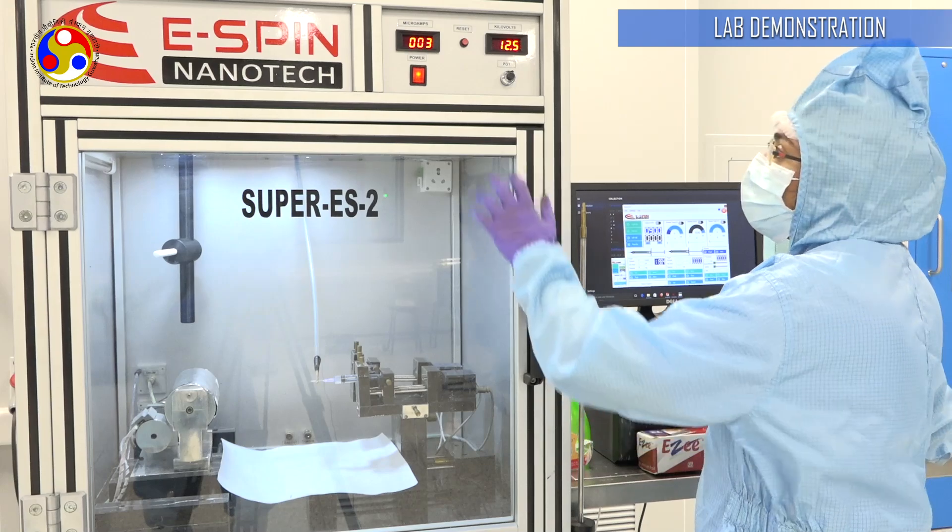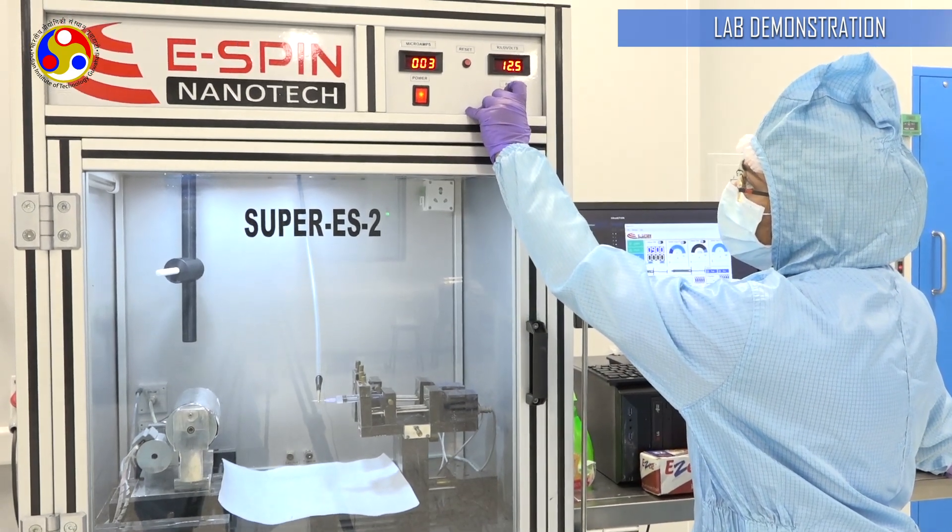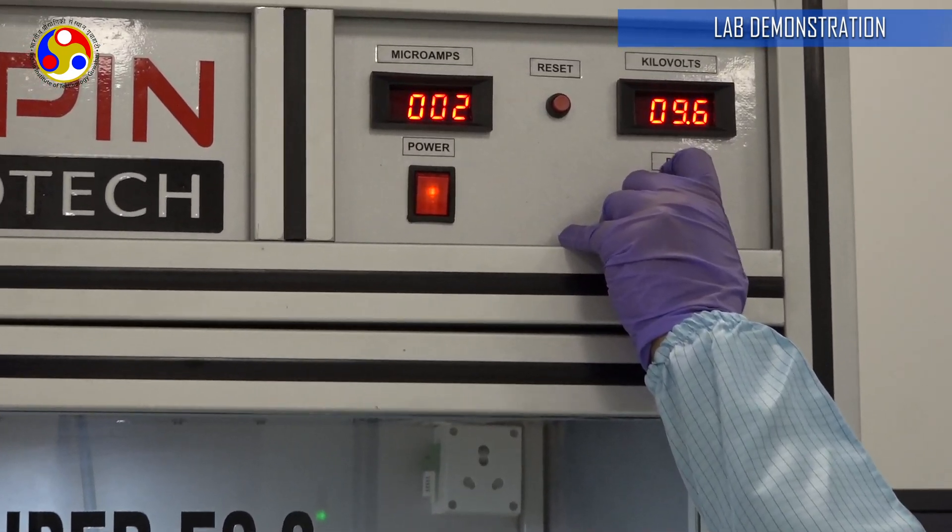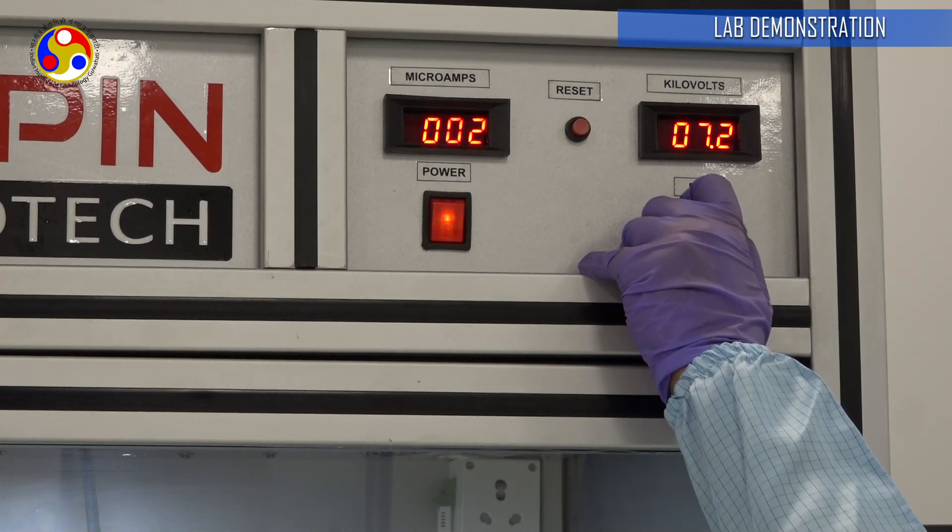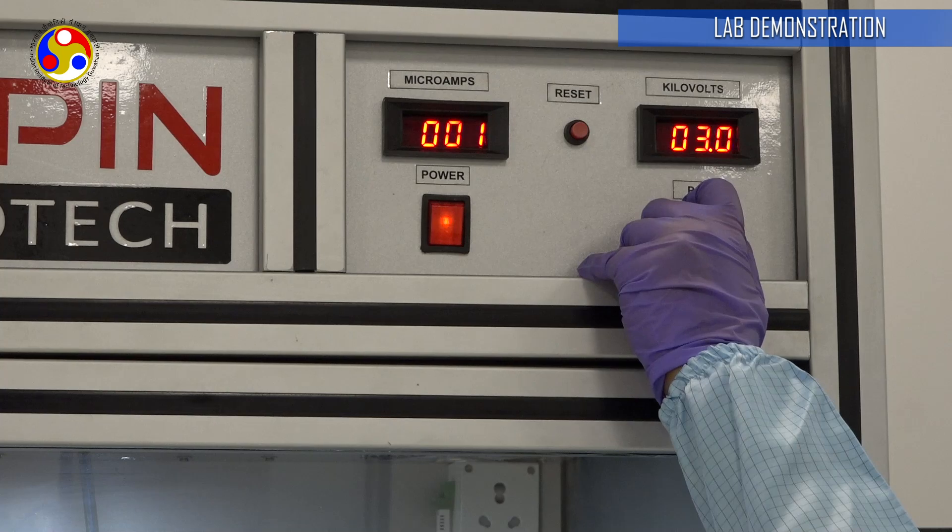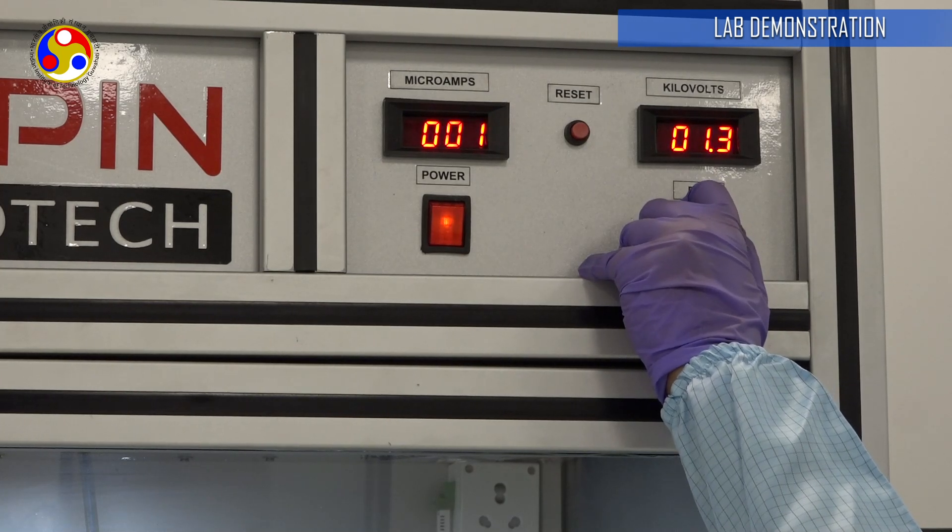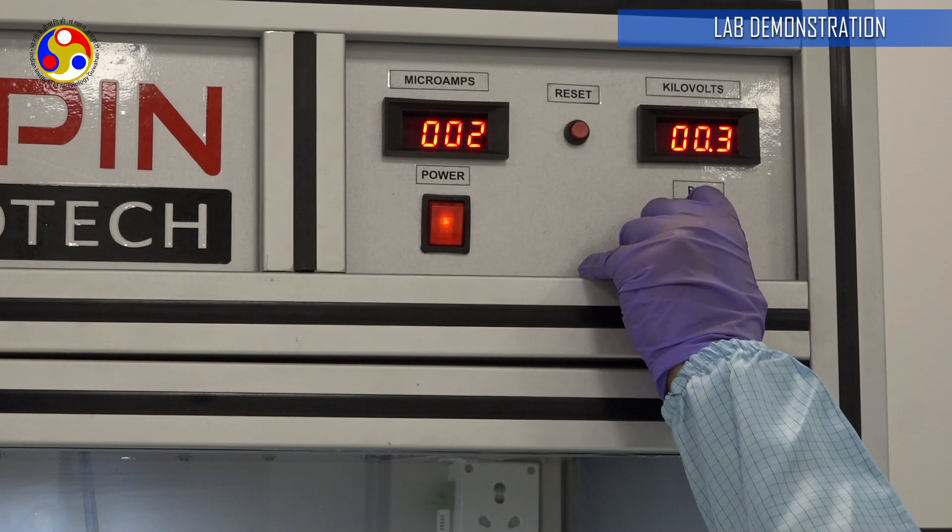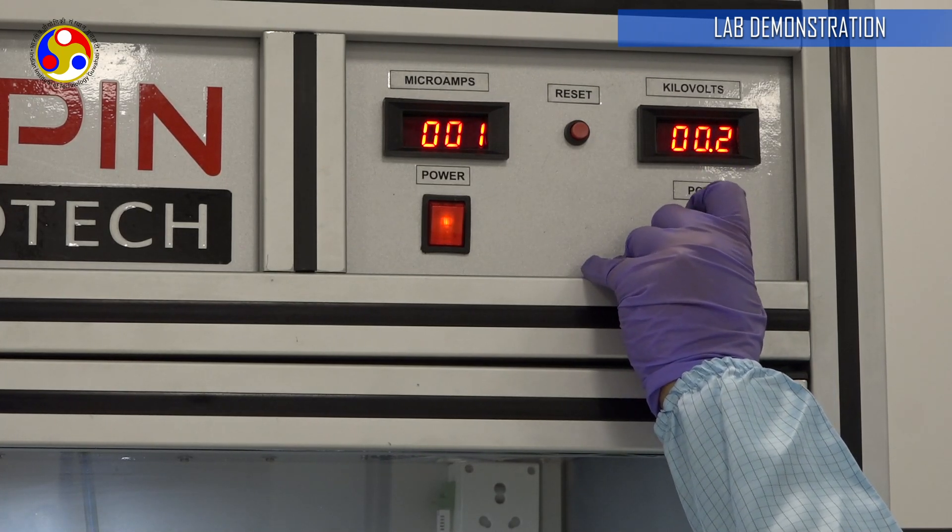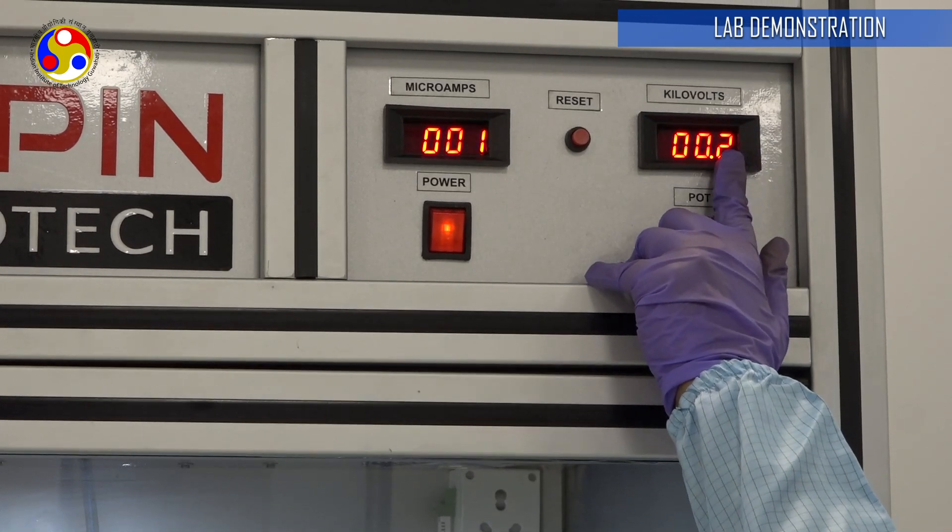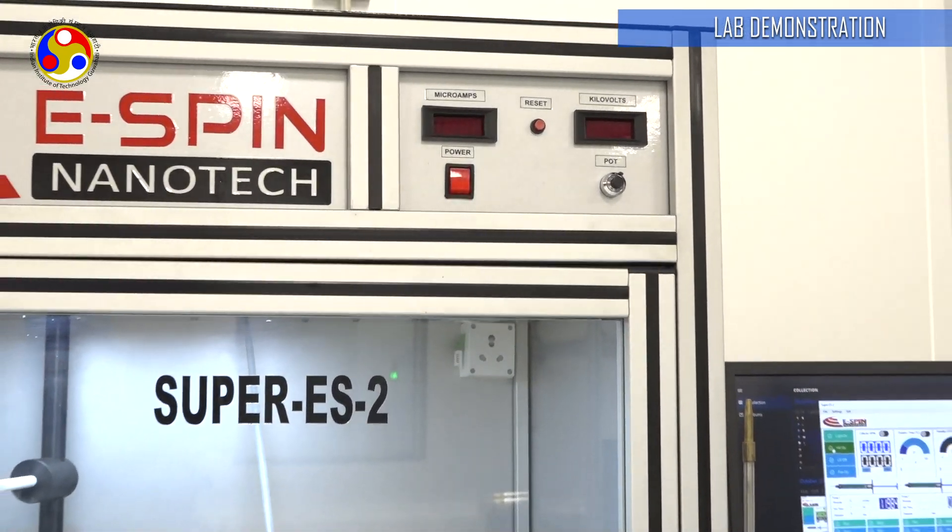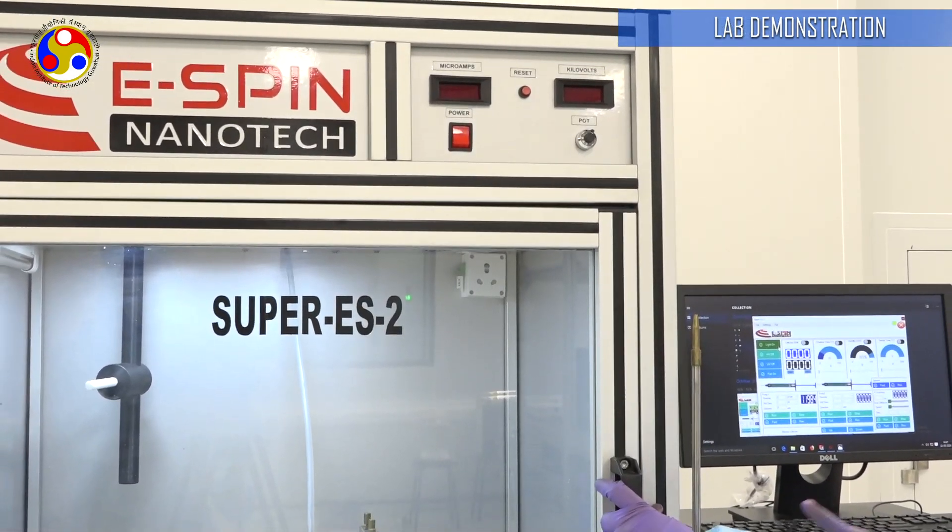The voltage is still at 12.5. I slowly have to reduce it back to its lowest value, 0 or 0.1, whichever it stays at. It's at the lowest turning point now and the value is not at 0 but it is at 0.2. We can switch it off. Then, we are going to turn HV off and now we are going to open the chamber.